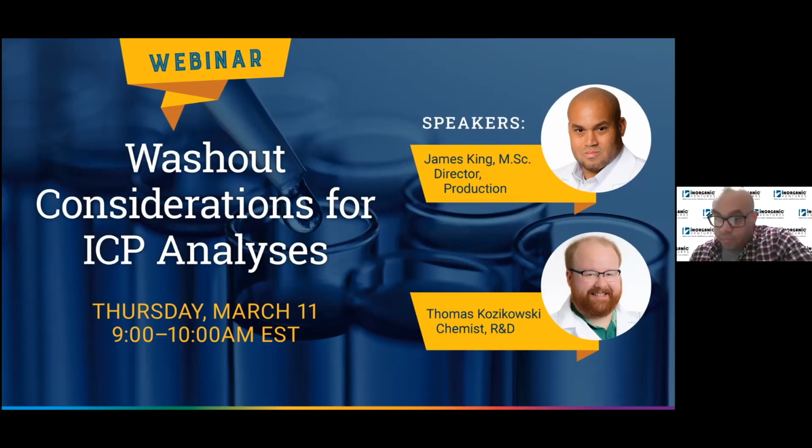All right, thank you, Brian, and good morning, everyone. Like Brian said, we're thankful that everybody is here today. We're gonna go through some washout considerations for your ICP analyses. You can go ahead and go to the next slide.